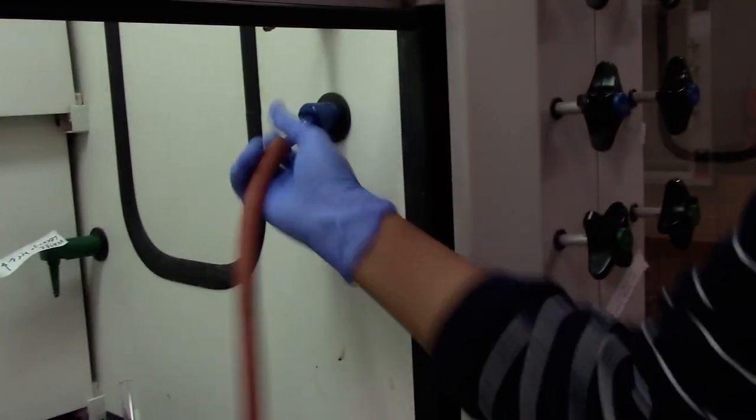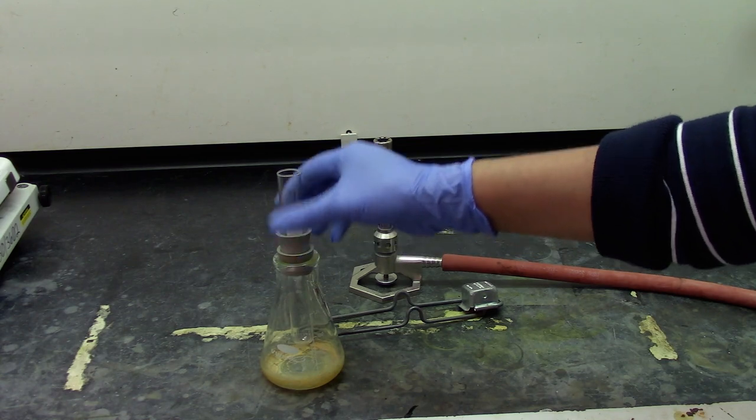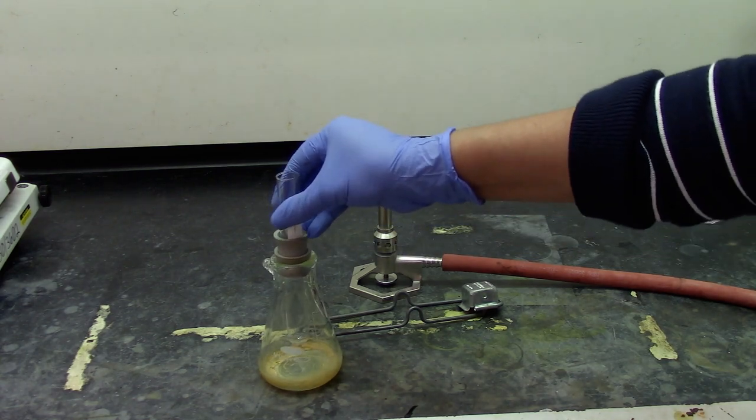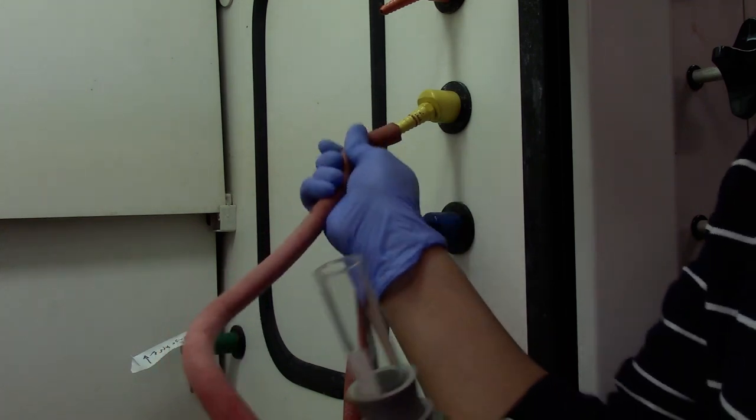For sublimation we need two vacuum tubes. One goes to the gas and connects to the Bunsen burner, the other one goes to the vacuum and connects to the side arm of the Erlenmeyer flask.